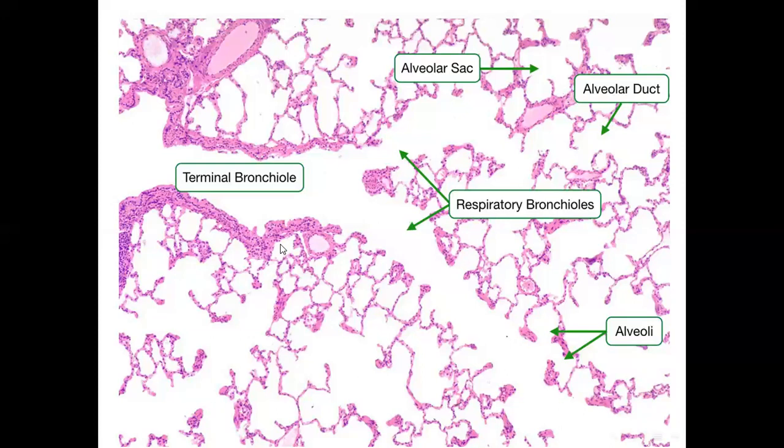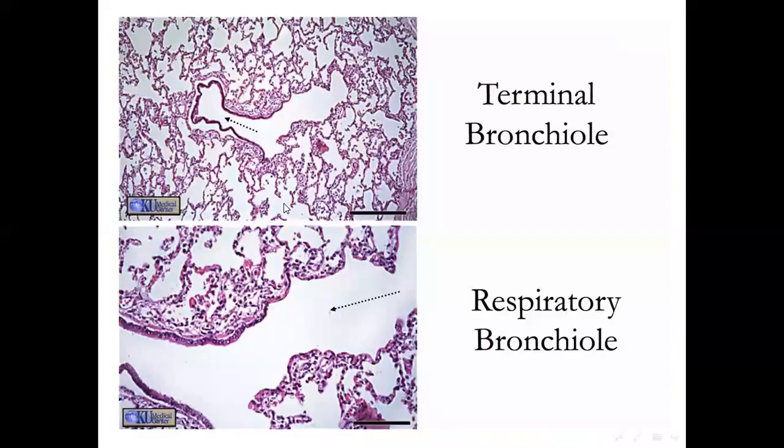يعني احنا شلون نميز التيرمينال bronchiole؟ عندنا خليت لكم أنا هنا هذا السلايد. هذا عندنا terminal bronchiole from the respiratory bronchiole الlining epithelium مالتها يصير broken up and invaded by the alveoli. راح نشوف فيها within the alveoli بداخلها. تمام. زين.